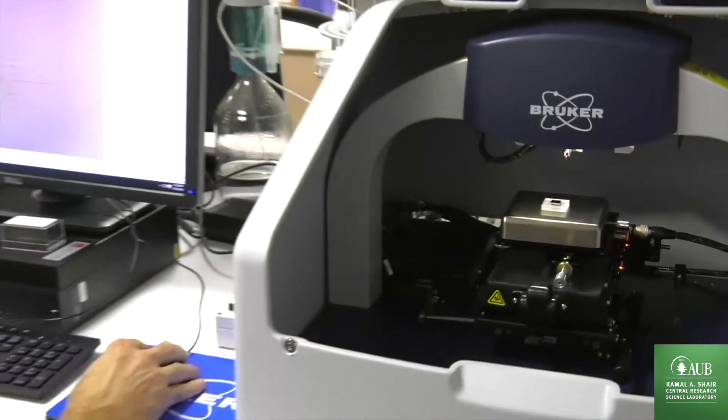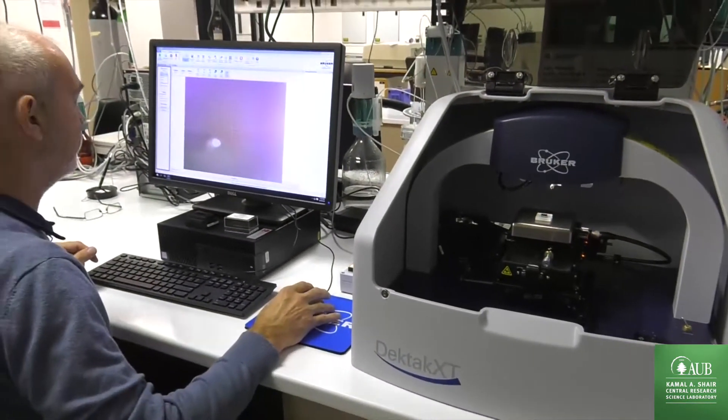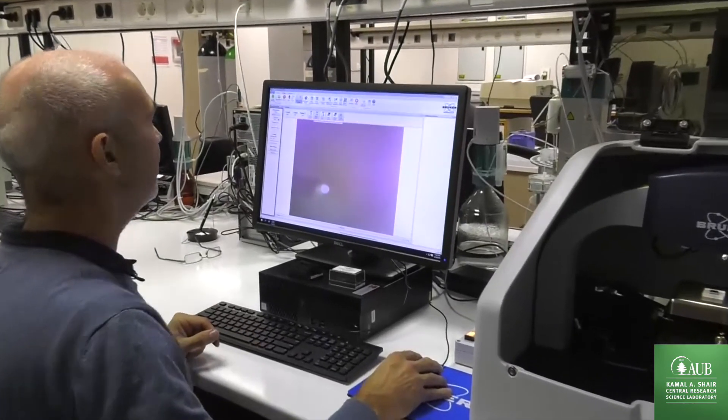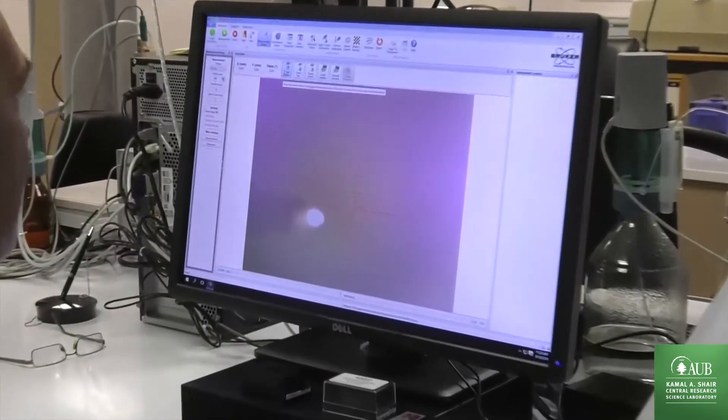We select the height range which is correct. We lower the stylus onto the sample.